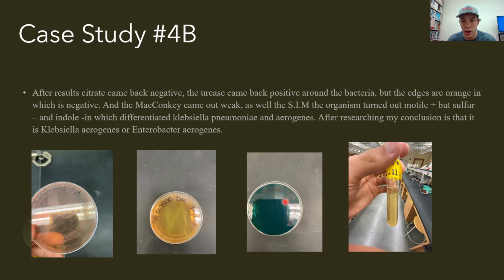I also had a citrate test and also used the lazy S technique, and it showed that the middle turned positive, but around it turned negative. So I just assumed that it was negative as well.